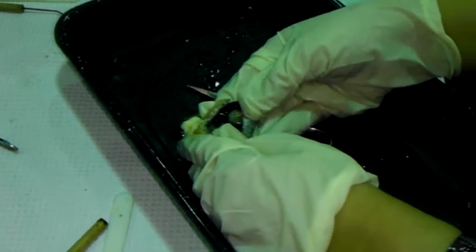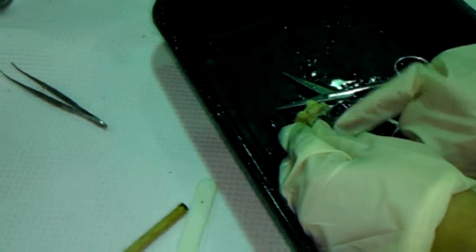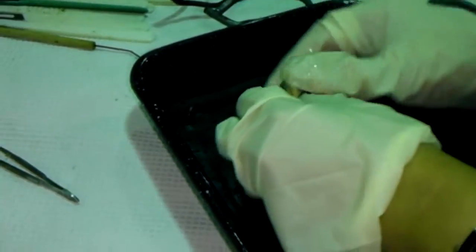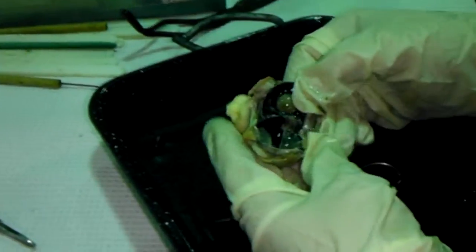When you dissect the eye, like this here, inside it you can see this structure. This is called the vitreous body. We will talk about it in the next session. Vitreous body is the jelly-like structure that we have here. Are you okay? And it's located inside the cavity that we call the posterior cavity. We will talk about it in the next session. So just know that this is the vitreous body. In class I will talk about it.